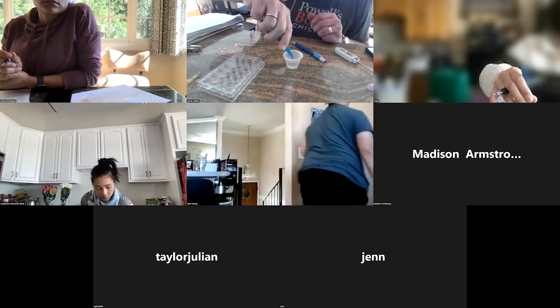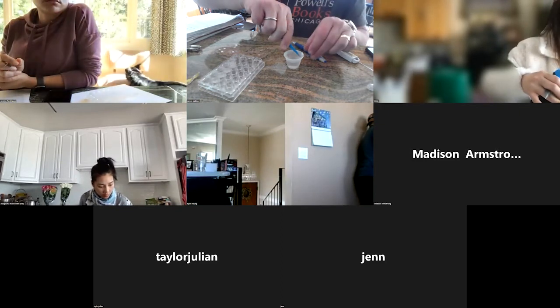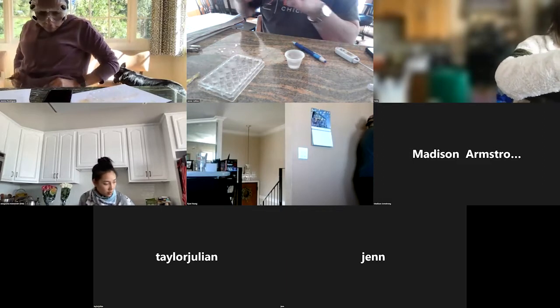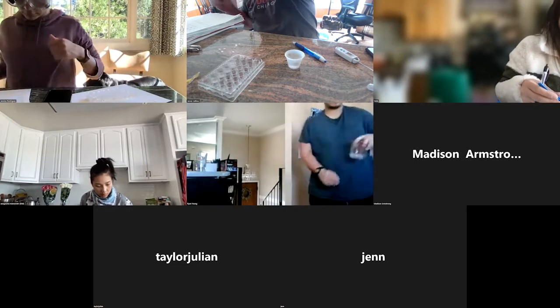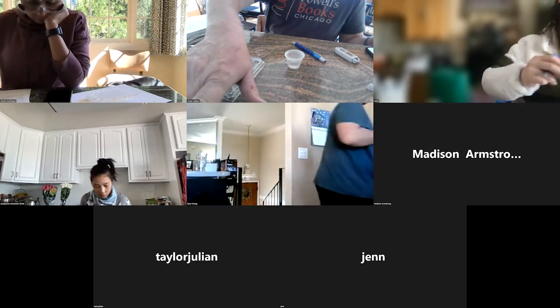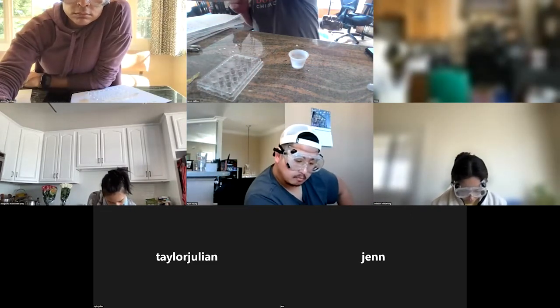So I'm going to do one trial with slightly above temperature, and then I'm going to plot these out, see what they look like. Now trying 30.